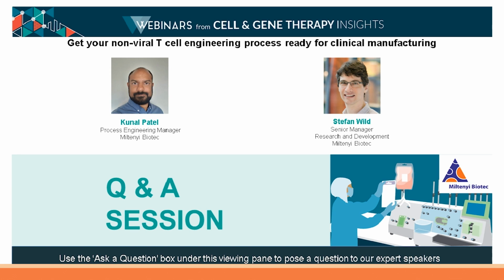Absolutely. And another one for you here, Stefan. Electroporation, what are the advantages of electroporation in comparison to viral strategies?